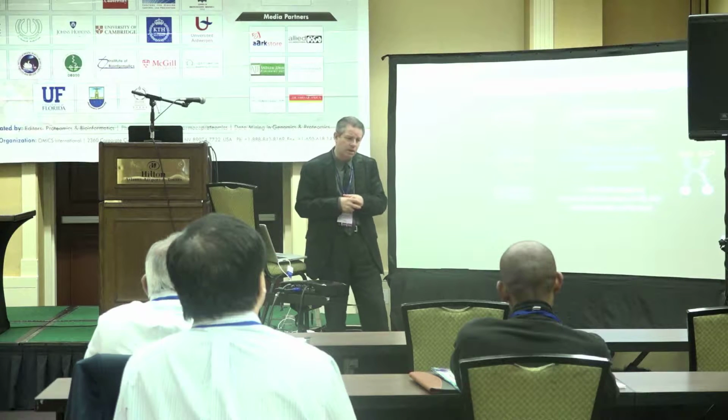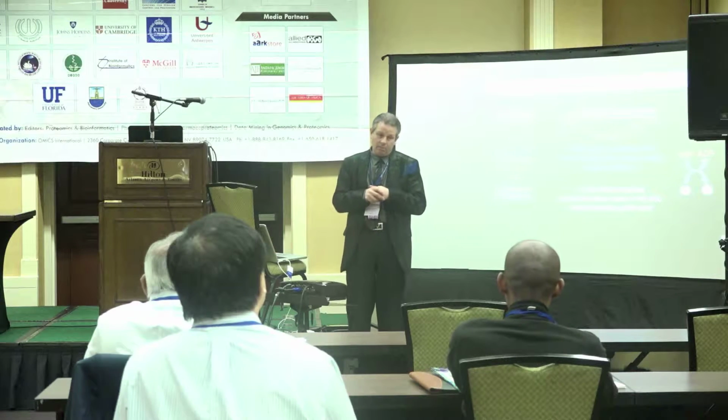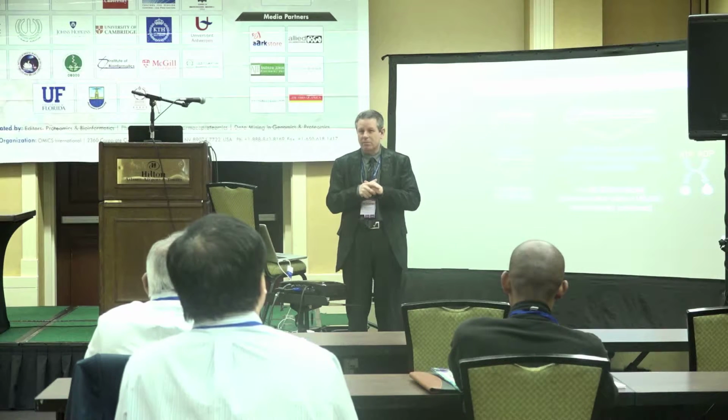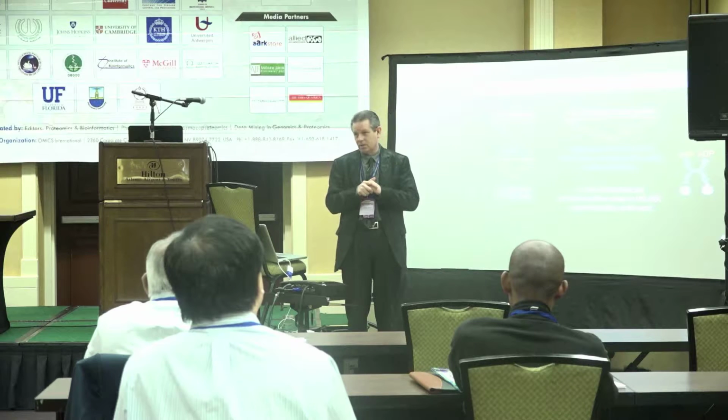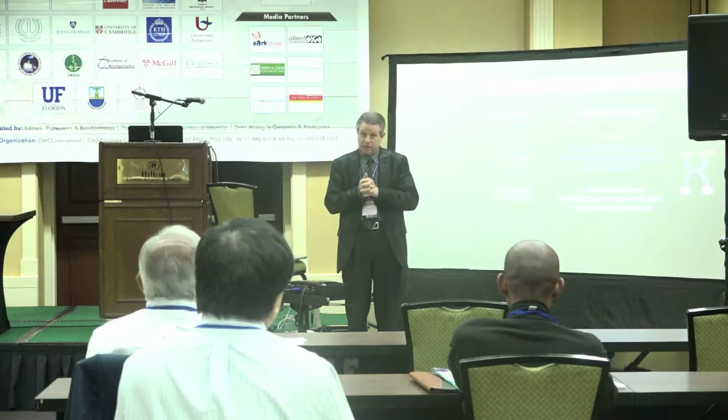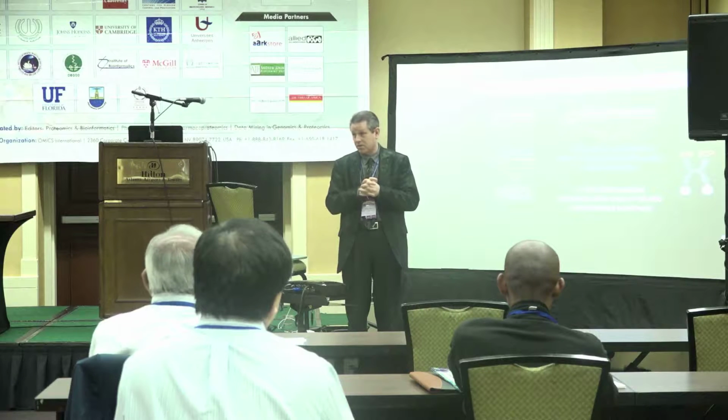If you were to do a study by mass spec, typically where you want to track thousands of phosphorylation sites in some sort of reliable fashion, you need about 20 to 30 milligrams of cell lysate protein. And you have to do your enrichments, and then you have to do multiple runs on the mass spec, probably in triplicate to get statistically significant data.